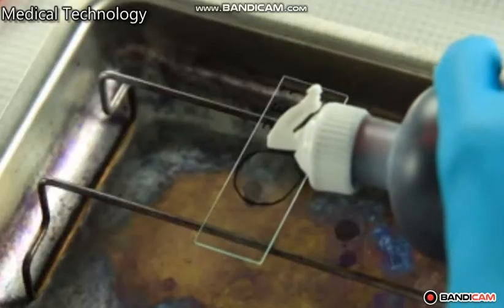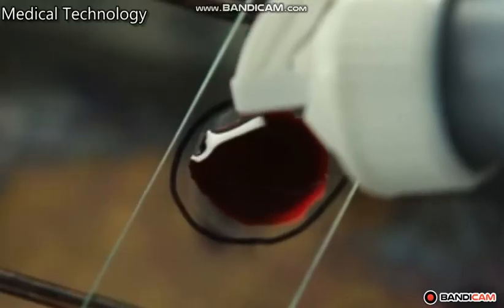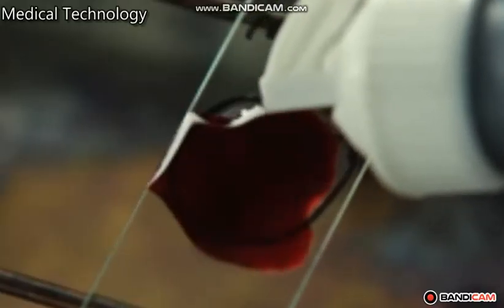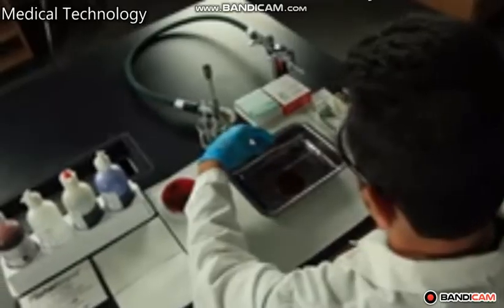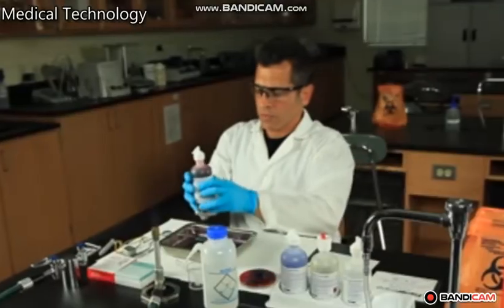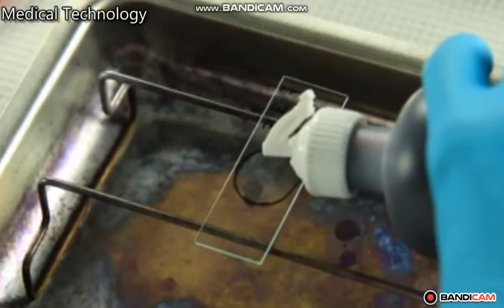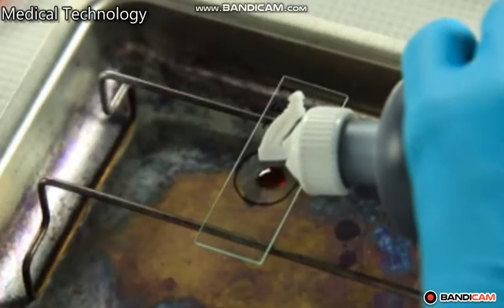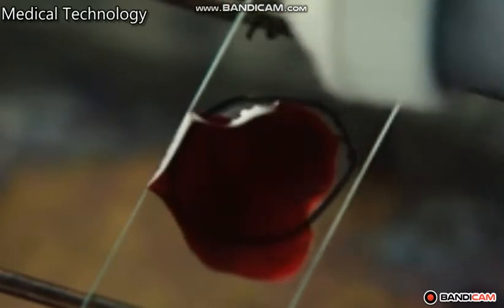Then take only one stain, either red, for example carbol fuchsin or neutral red or safranin.